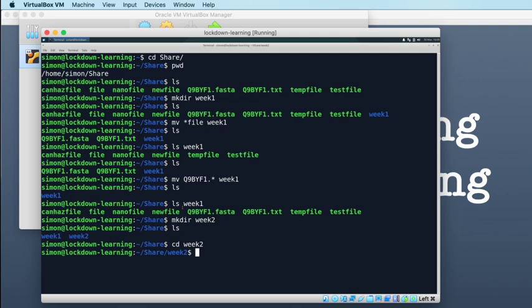So what we're going to start with is downloading some data. Usually if we want a data set that we're going to work with, we almost always have to download that data from somewhere. So later on, when we come to looking at an RNA-Seq data set, we will have to download the sequencing data from either the Sequence Read Archive or the European Nucleotide Archive, depending on our preference. But we're still going to have to download that data. We can't just magic it out of thin air. And it's the same for almost any data set. We need the ability to be able to download that data.